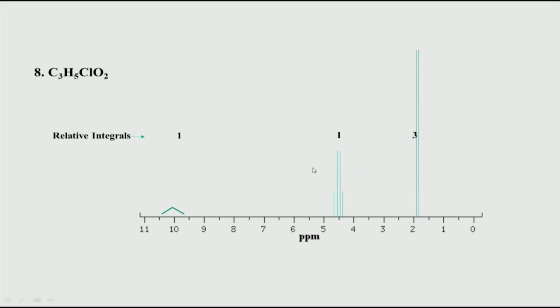So, let us now look at this example. Again here we have a carboxylic acid group, that is why the proton is a single proton and coming very much downfield shifted. Now, instead of two triplets that we saw, there is now a quartet and a doublet. Remember this is CH3. It means it is a methyl group, and that seems to be coupled to one hydrogen, because only then you get a doublet. And that one hydrogen is coupled in turn to this 3.